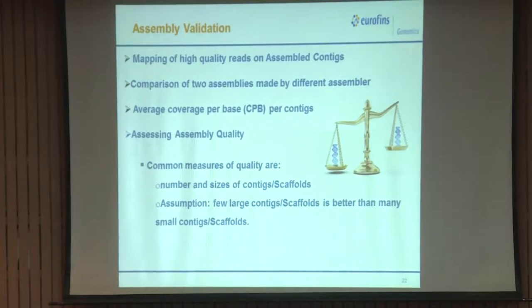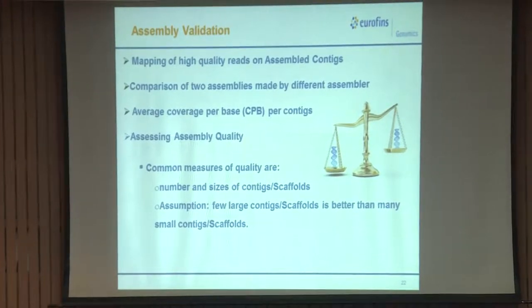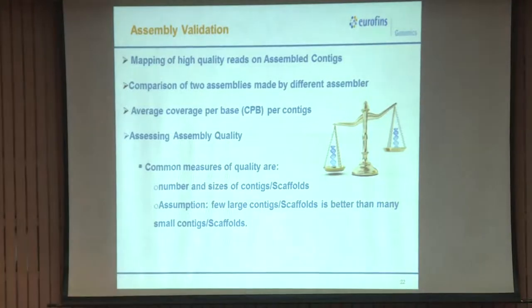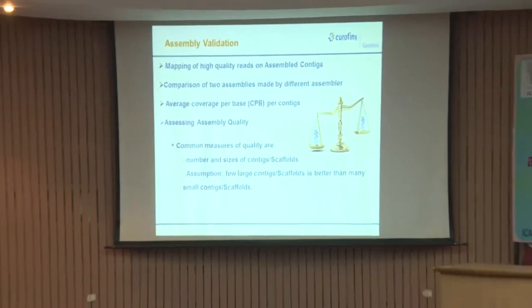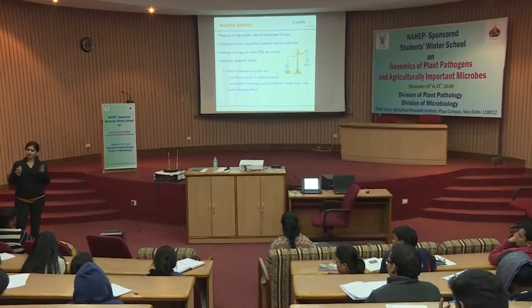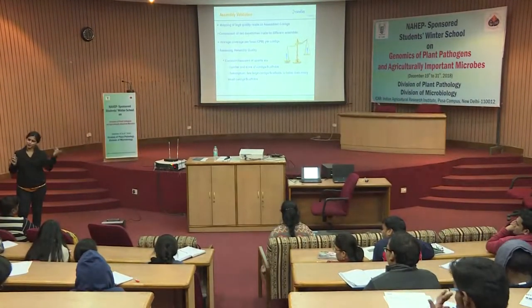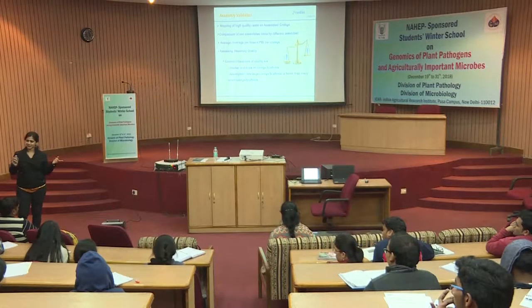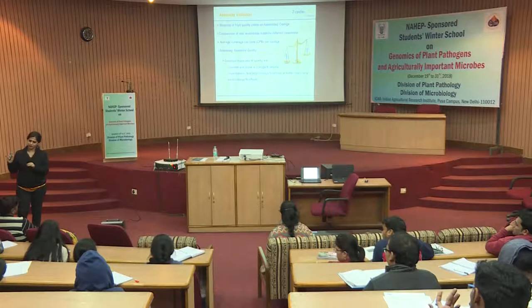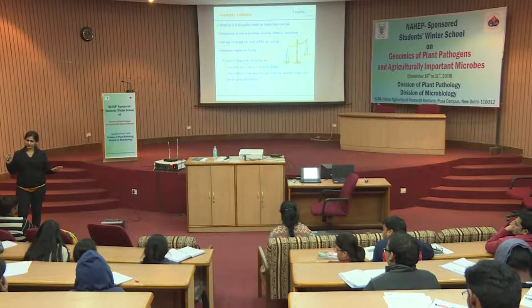Between the scaffolds, with another platform like PacBio or whatever you will use. Yes. Since before you told that 10% may be the error in that platform. Yeah. But if we are using a hybrid approach, we will eliminate those errors using short read technology. No, beforehand only we are eliminating. We will do the filtration beforehand of only PacBio data, eliminate those errors and then use it.